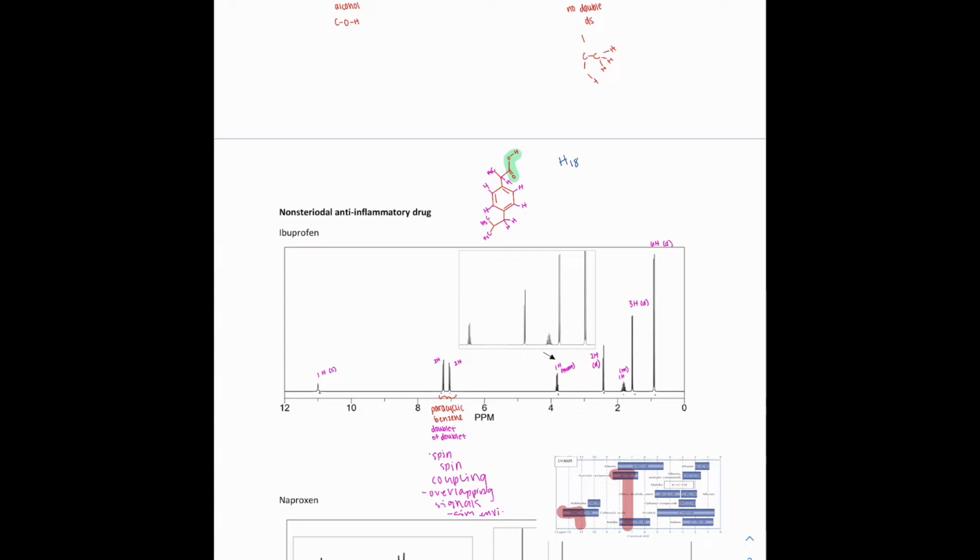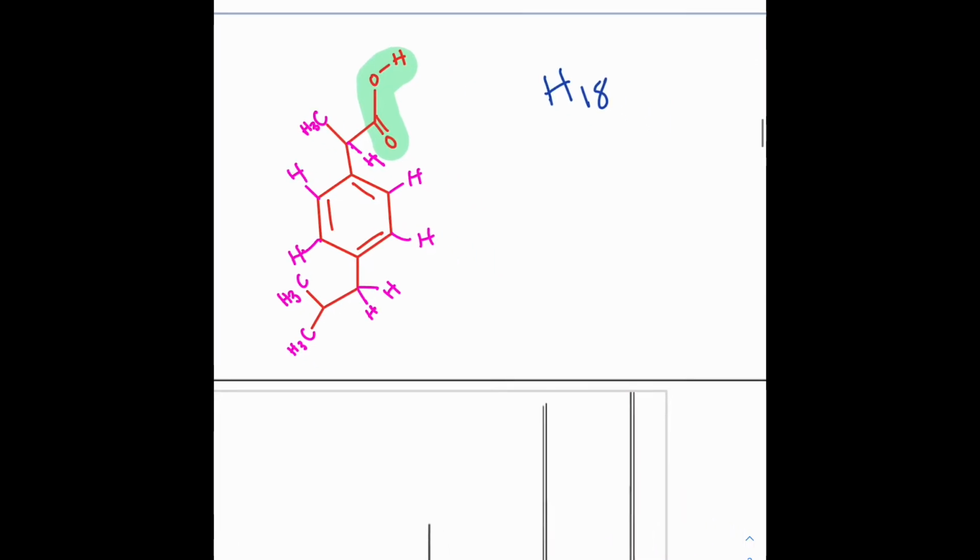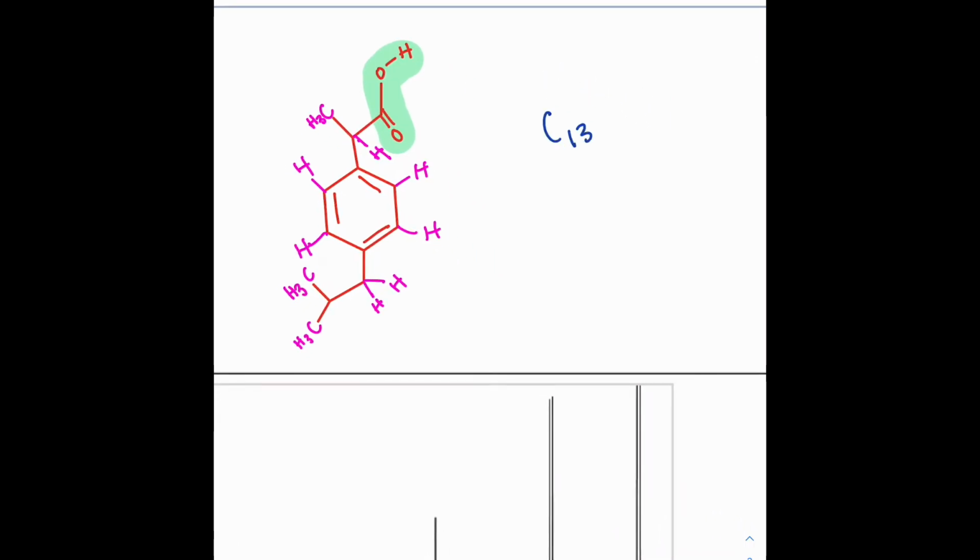The next molecule, proton NMR, that I'm going to explain is that for ibuprofen. I went ahead and looked up the structure and the formula for ibuprofen, but I will explain how to determine what the proton signals in the NMR mean, in a way that helps if you were not aware of what the structure was, or how to piece it all together.